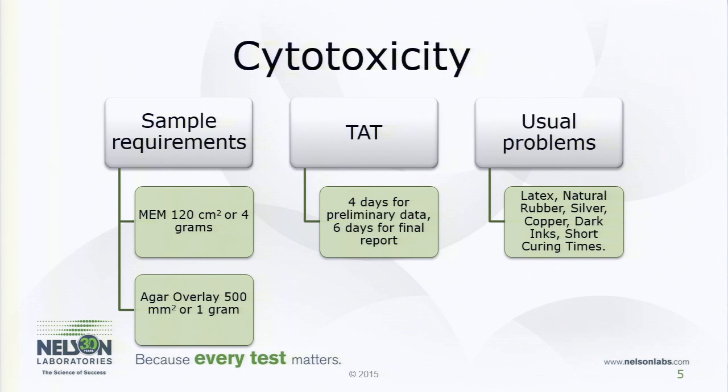For the cytotoxicity, latex is what we use for a positive control, okay? So latex kind of does pretty bad things to cells. So if you have latex in your device, it's gonna fail. But that doesn't mean you can't use latex, right? I mean, how many decades have doctors been using latex gloves? What it means is we have to look at it from a risk assessment of why you failed that test or why you might fail that test. We might want to remove the latex to see if there's any other components in your device that are cytotoxic, and then justify why accepting that toxicity of that latex. That also goes for other natural rubbers.